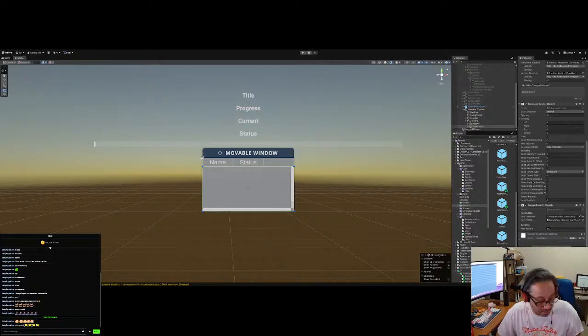And then what sample does is feed it to the enhanced scroller, and the enhanced scroller is going to see if we have a prefab, which we have set over here. Right here, the sample row prefab, which we made, and then it handles the instantiation and recycling of the list.